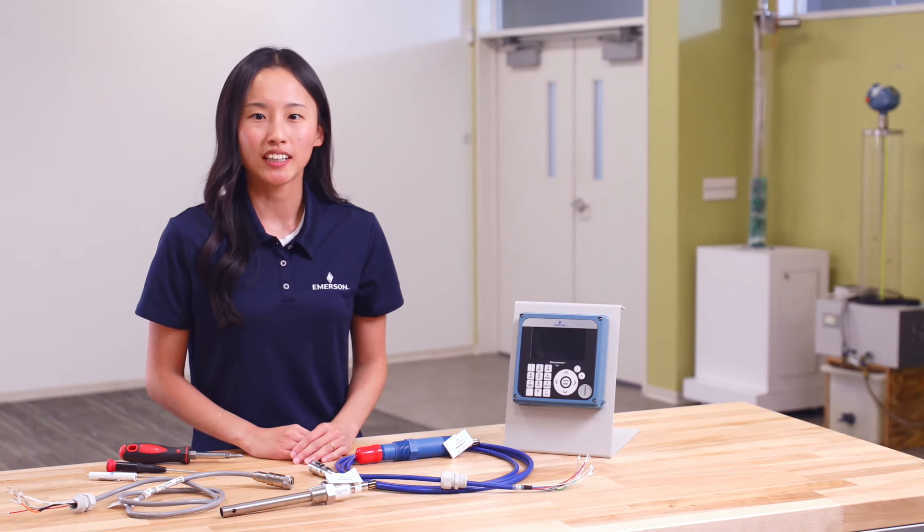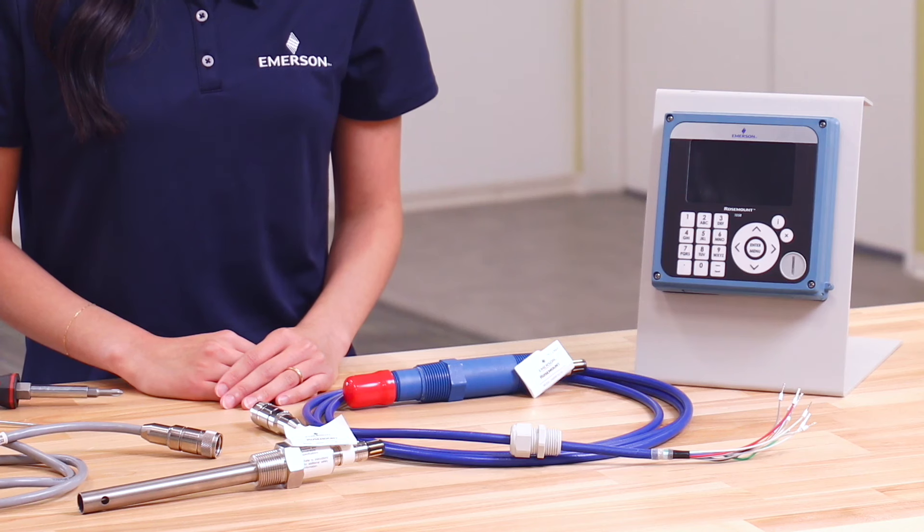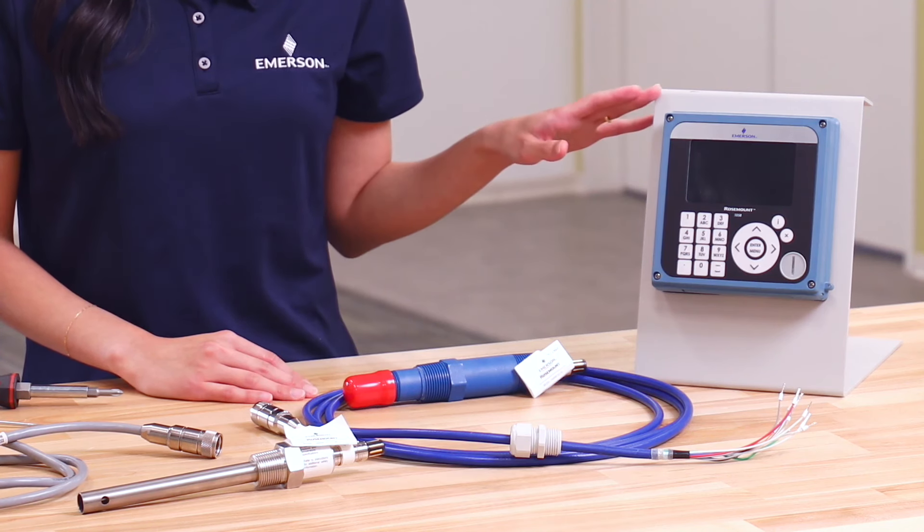Hi, my name is Rachel Zhang and I'm a Global Product Manager for Liquid Analysis at Emerson. Today I will take you through how to connect a Rosemount PH/ORP sensor and contacting conductivity sensor to a Rosemount 1058 dual channel transmitter.